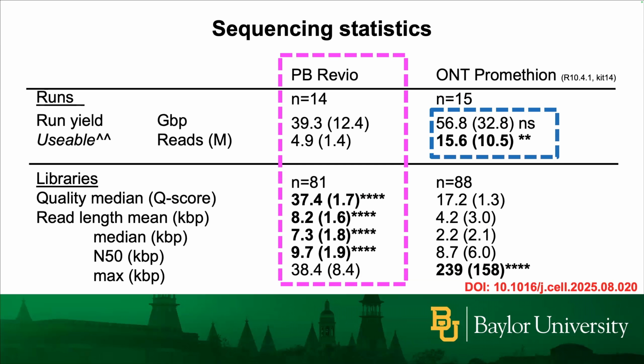So why is this? Why is PacBio generating more complete MAGs? I think there are a few things. In terms of sequencing yield, while it wasn't significant, they were pretty similar in yields. Although I will say that with our recent runs on the Revio, our best was 80 or 85 gigs. So this has improved, especially with Spark chemistry. But as for the amount of usable reads, Nanopore produces more reads.